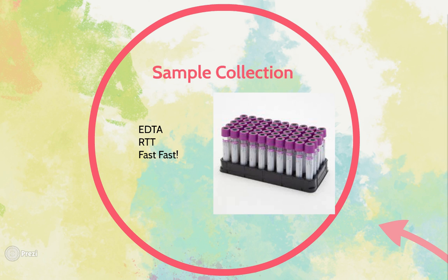Then, of course, depending on the type of fluid that you've got in the bottom of your tube, you're going to apply the appropriate smear technique. So if it's thin, think about a line smear, especially if it's thin and clear, such as a transudate, then a line smear would probably be most appropriate. If it's blood, hemorrhagic or otherwise, or a blood-like consistency, then you can just do a typical blood smear, a wedge smear. And then if it's really thick, of course, we're going to do a squash prep.